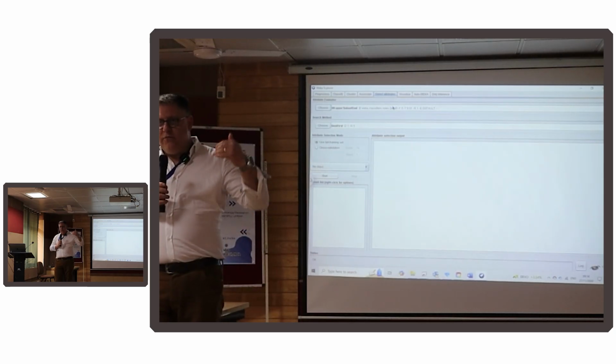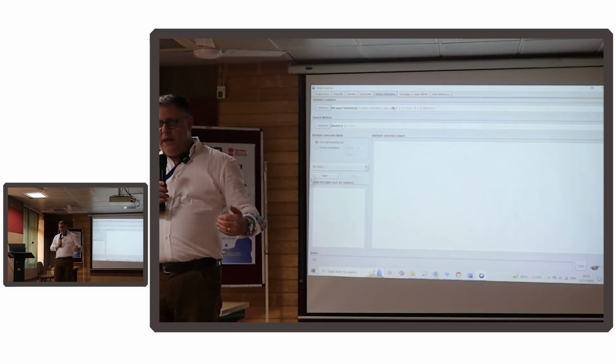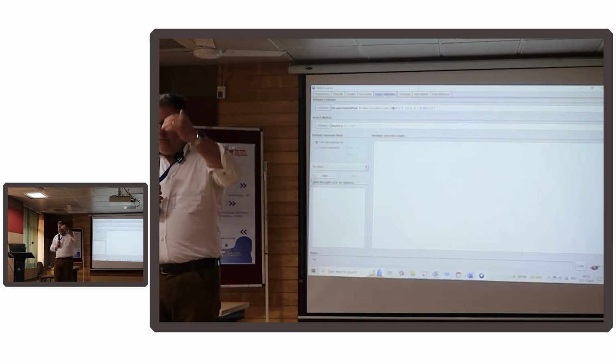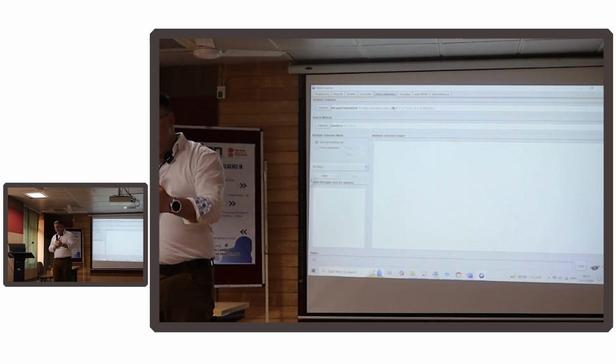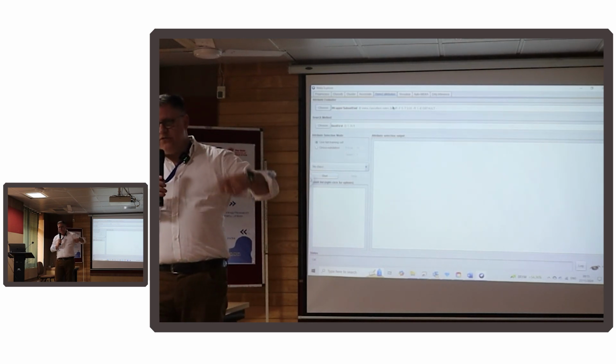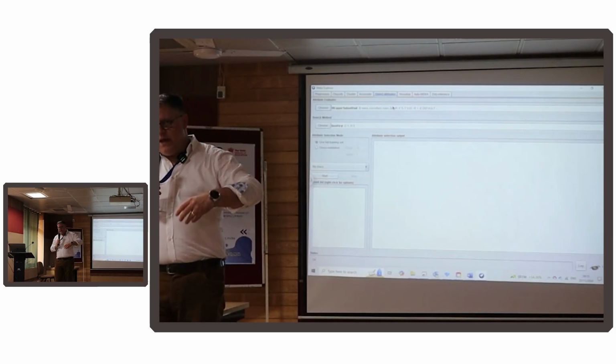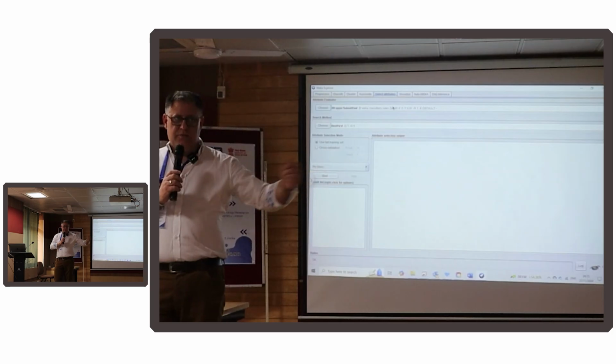So we have two forms. Effectively we have a filter method, which looks at the performance of individual features and selects the best ones from that. And then we have a wrapper method, which uses an algorithm's performance. What we're essentially using here is a combination of a filter and a wrapper. So we use the algorithm performance in the filter to select the best parameters.